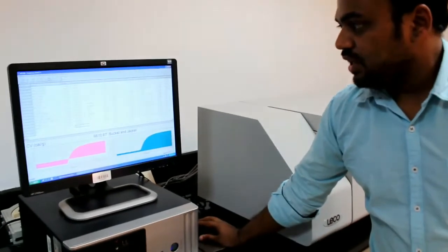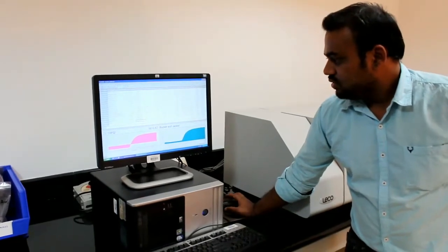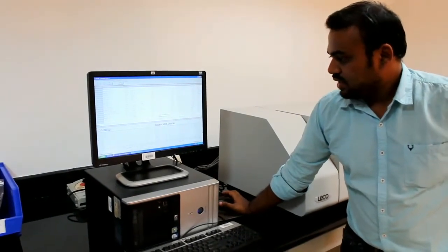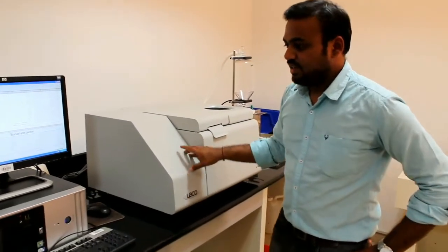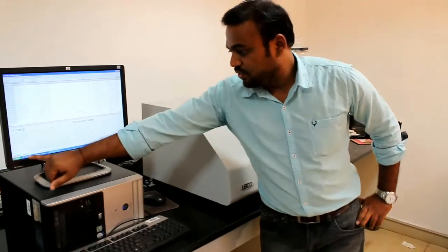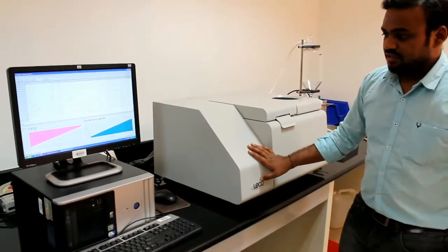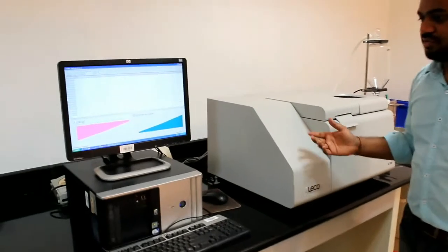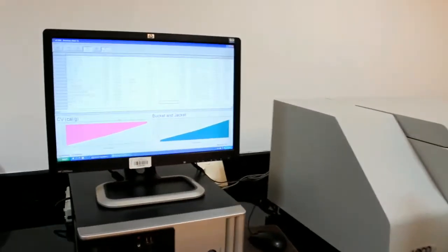Now we will give the analyze. We will click this one. As I told earlier, it takes 8 minutes. In that 8 minutes, 3 minutes for equilibrium. Here you can observe here, 3 minutes we are getting for equilibrium. After 3 minutes, it takes 5 minutes for analyzing the sample. That is, sample will completely burn in that 5 minutes.